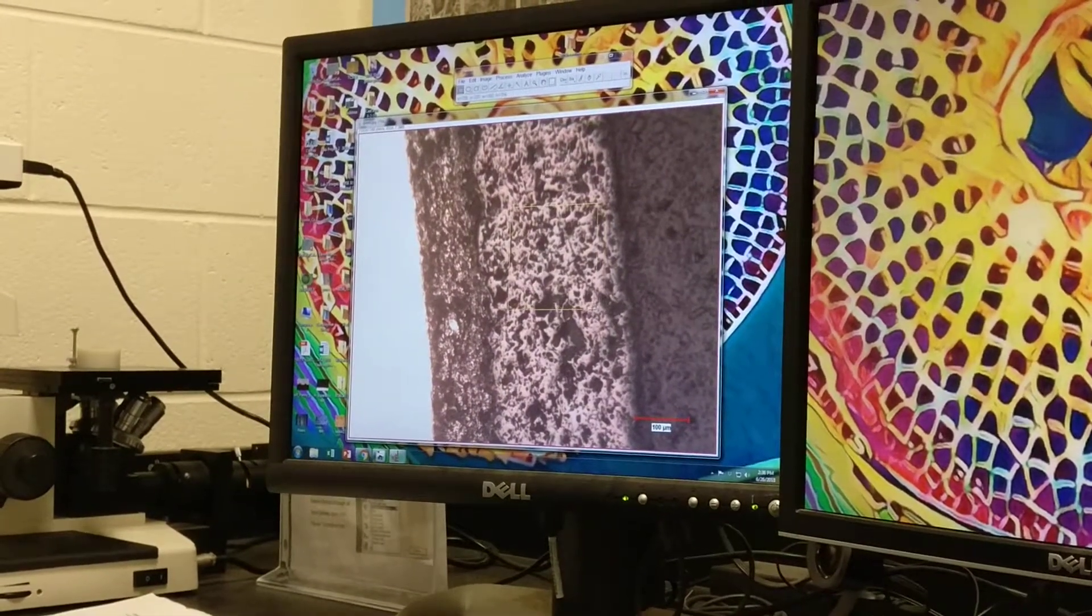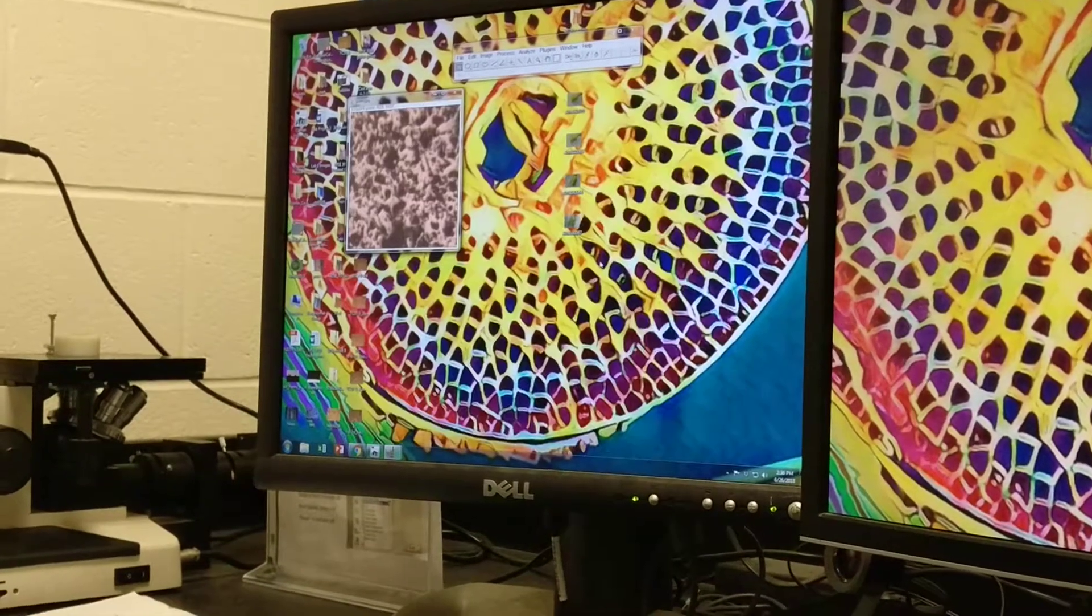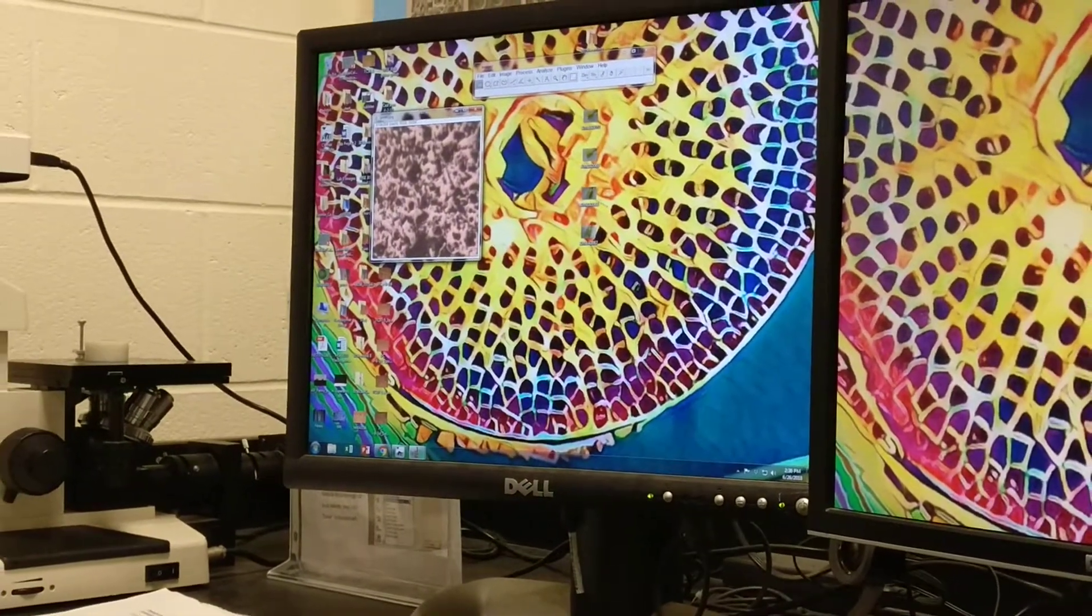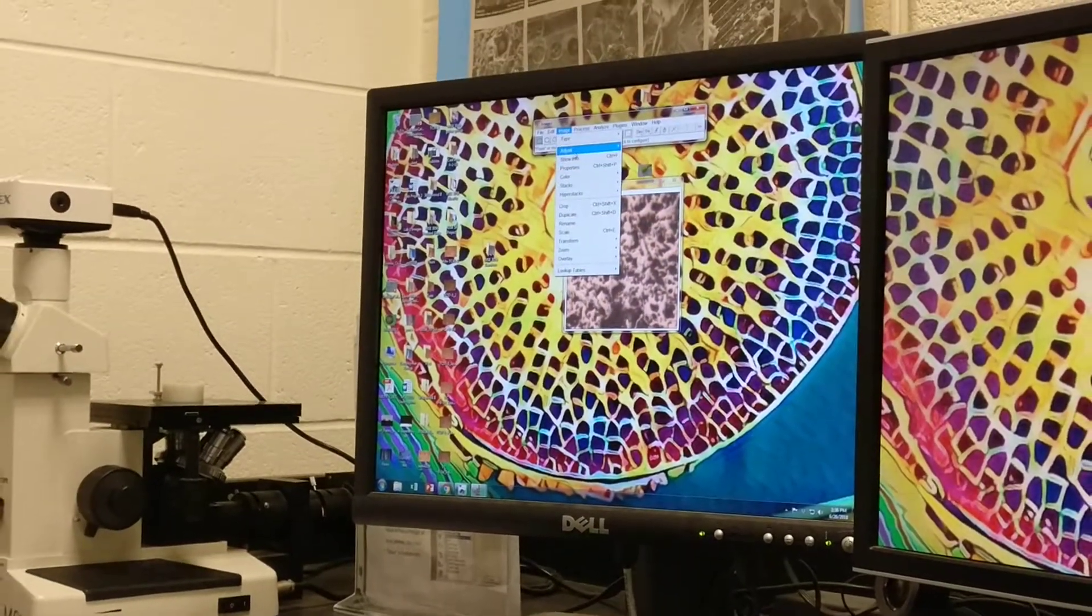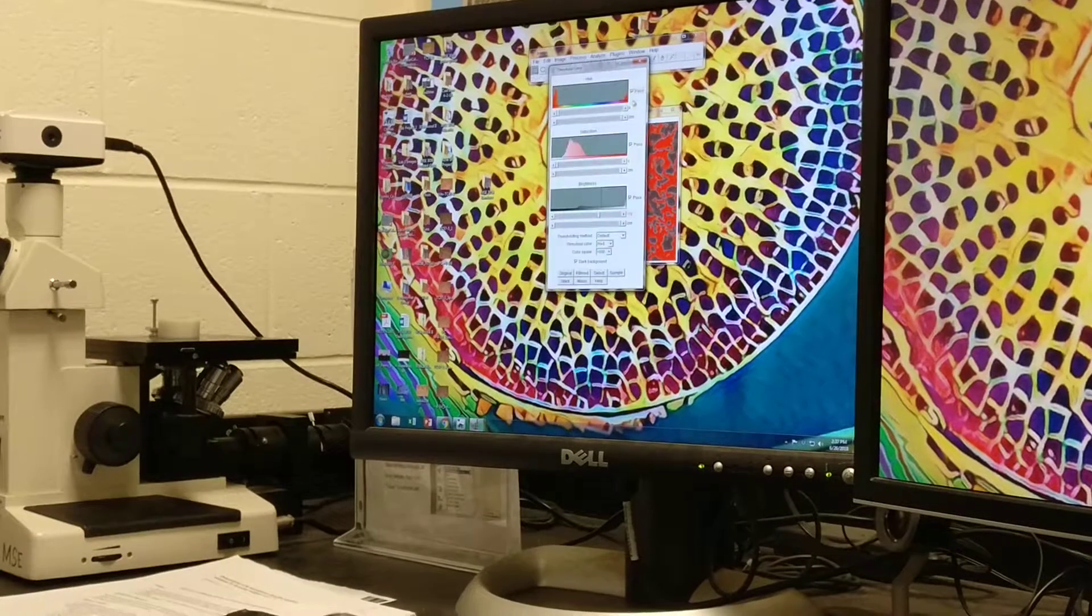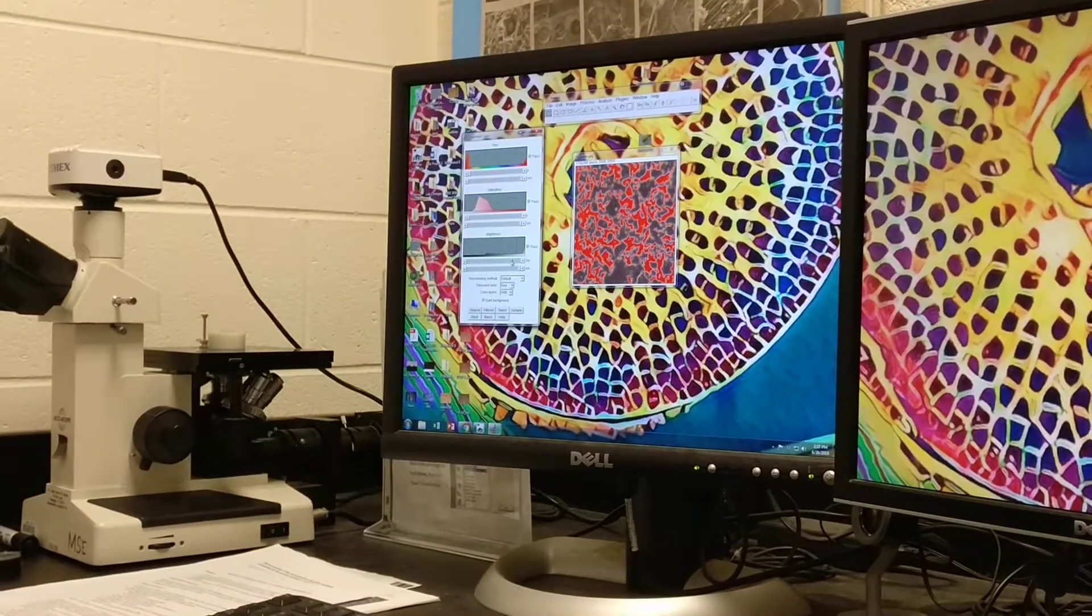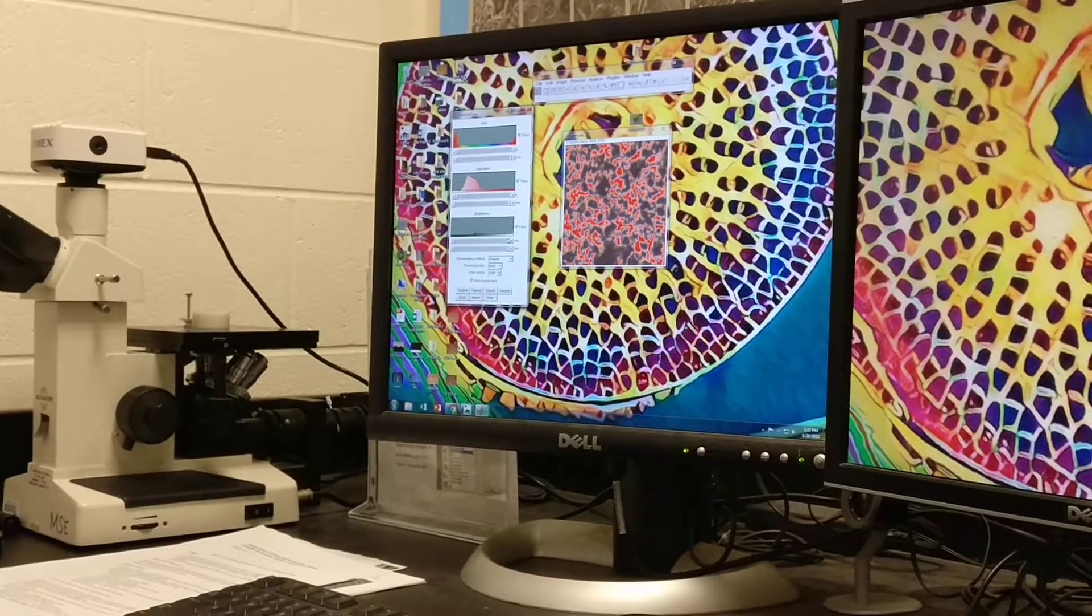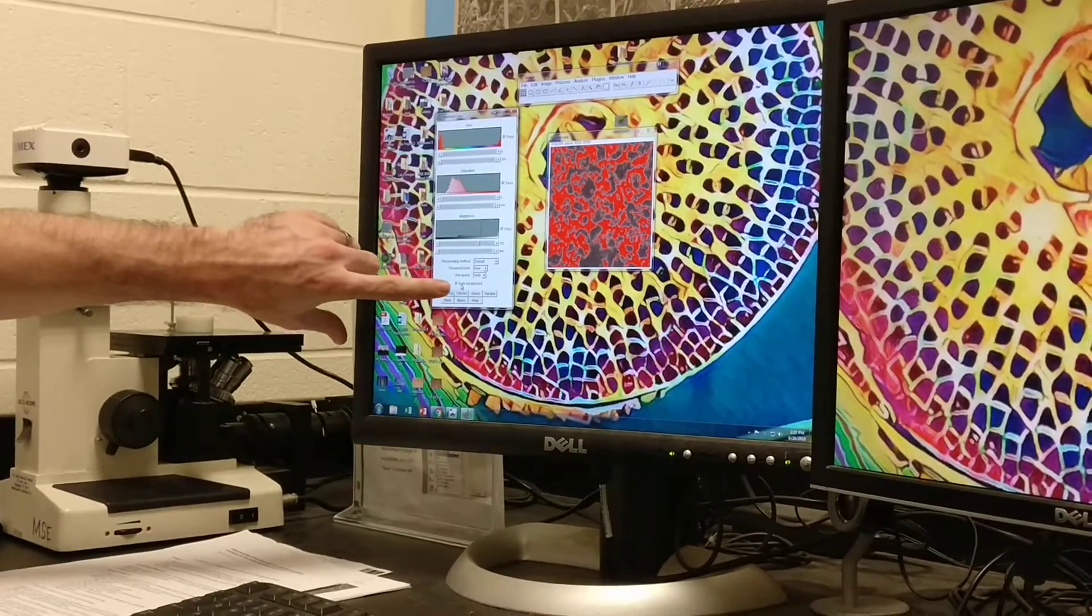First thing is we're going to select the area of interest which is in that layer with the rectangle box tool. We're going to type on the keyboard ctrl shift X which will crop that area we've selected. We're going to do image, adjust, and threshold. With this we are going to use these sliders on the histogram to select the area that is dark.